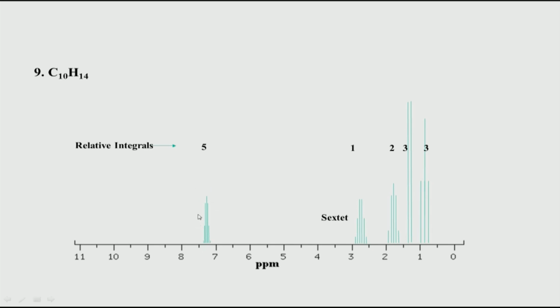So, what we do normally is we do not analyze the aromatic pattern. The reason is that there are two things. One is there is long range coupling present. So, the hydrogens are not only coupled to the 3 bond hydrogens, which is what we typically use when we analyze this type of data, but they are also coupled to hydrogens 5 bonds away and so on. And these are strong couplings, in the sense that the chemical shift difference between them is very small and the coupling is bigger than that. So, we have what is called a strong coupling scenario, and because of that the peak pattern you see here in the aromatic ring is not straightforward to interpret compared to what you see here.